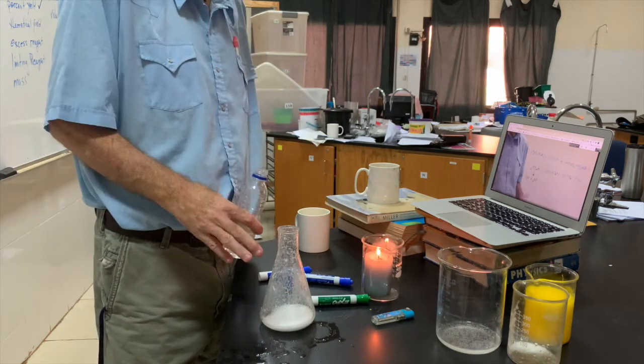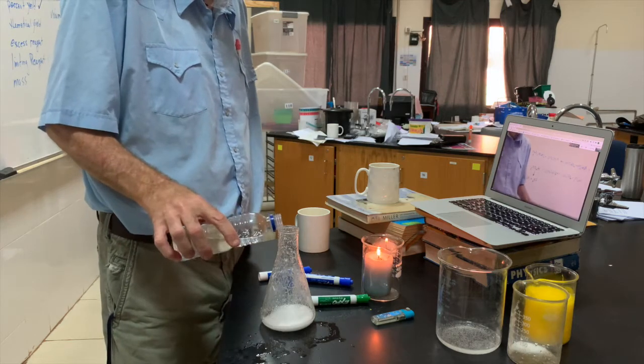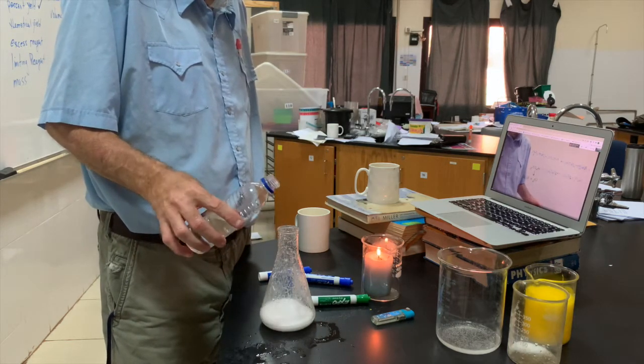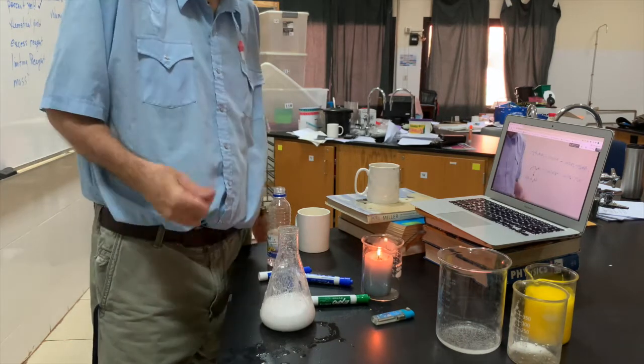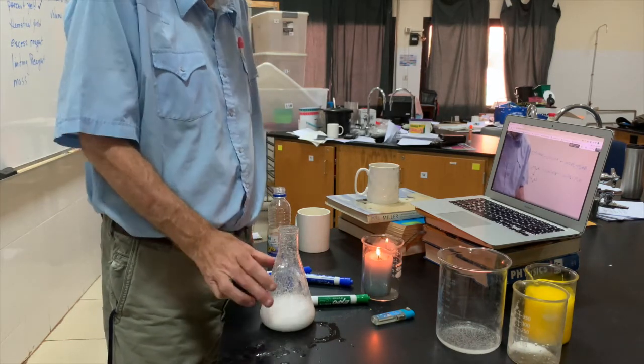So I have plenty of sodium carbonate left. So I'll make a little bit more, right? And I'm going to pour it. I'm going to pour it in. You ready?